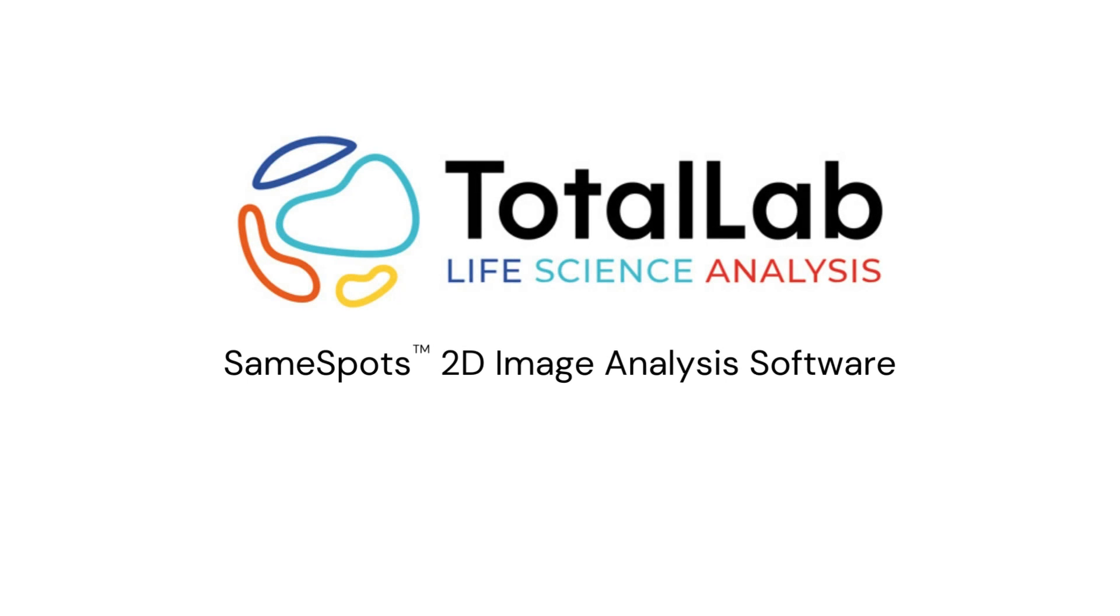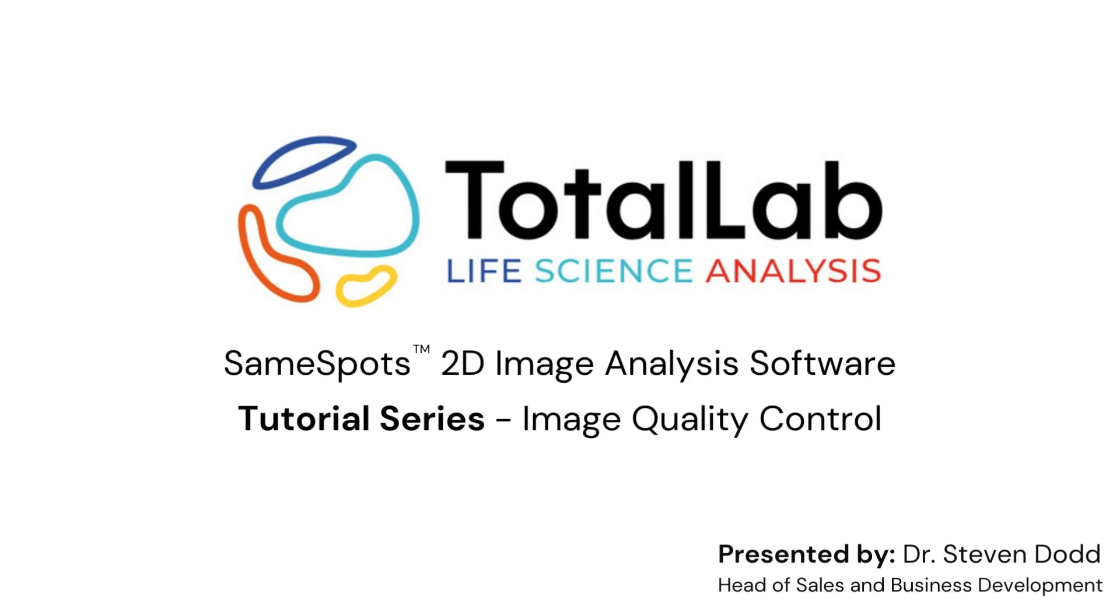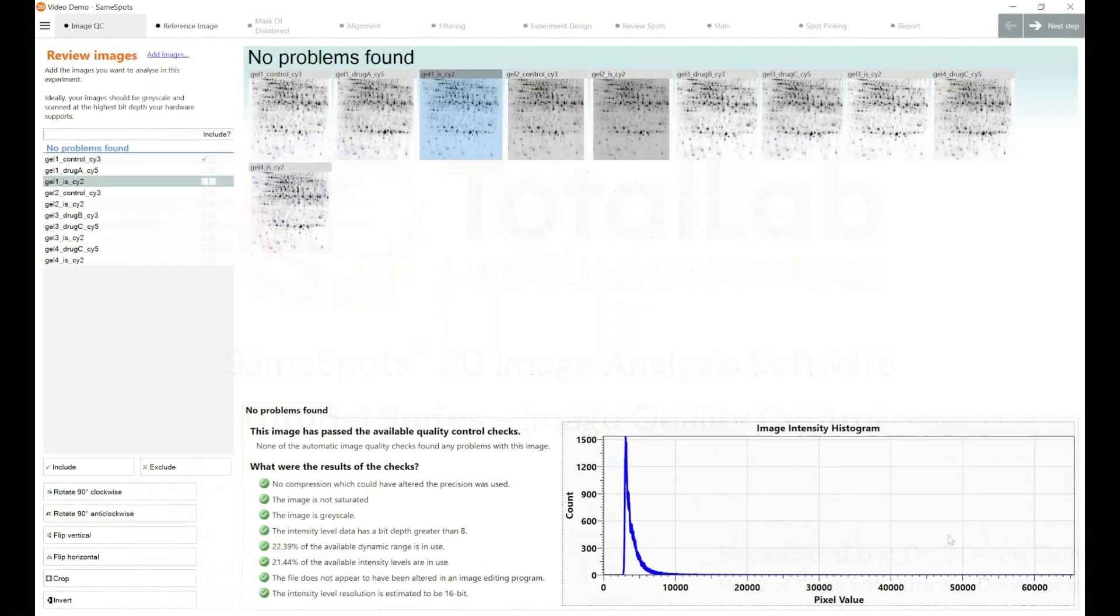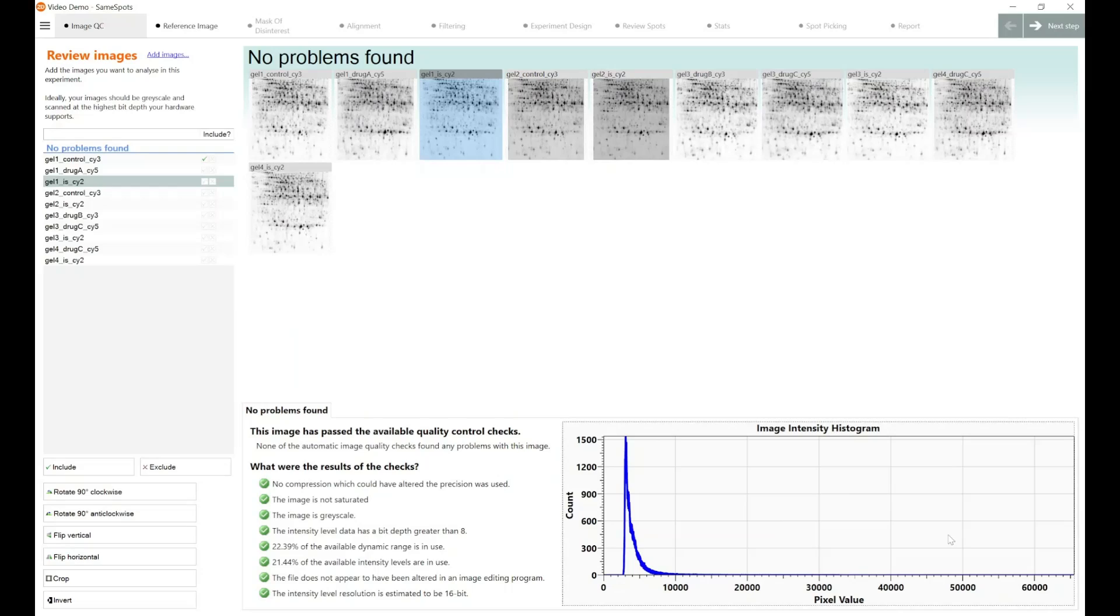Hello everyone. Today I'm going to run through the tools that are built directly into SameSpots to ensure that you have a high level of quality control between your images within your lab and between your operators to maintain a high standard level of your analysis.